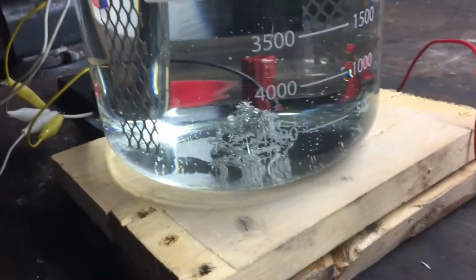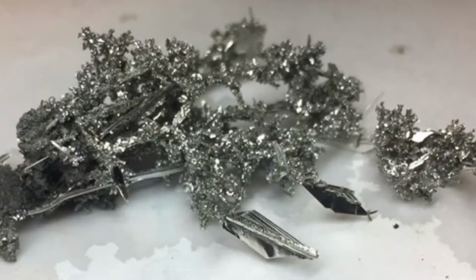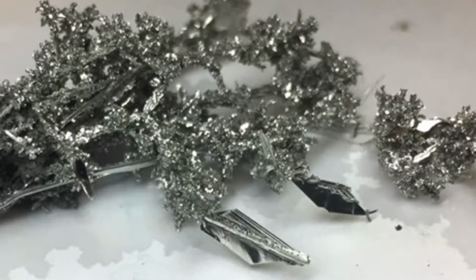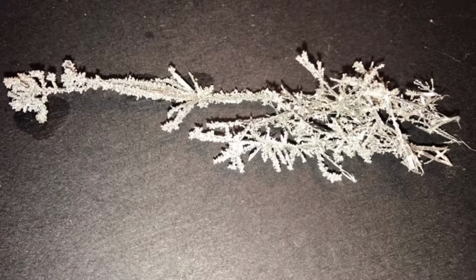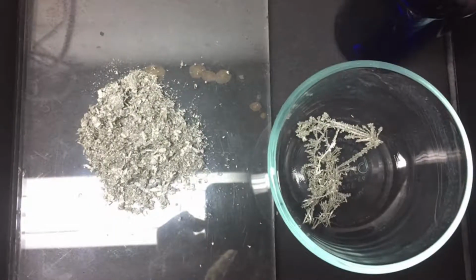So it's been a full day, and just a few minutes ago it looks like the tin crystals fell off of the electrode, and new ones are reforming. So hopefully these newer ones will have a stronger structure and be able to actually stay on the electrode. So over a few weeks, by altering the current density and the concentration of stannous chloride in solution, I was able to grow a bunch of different crystals and produce quite a few different samples, as well as some tin which I can use in my future experiments and things like that.